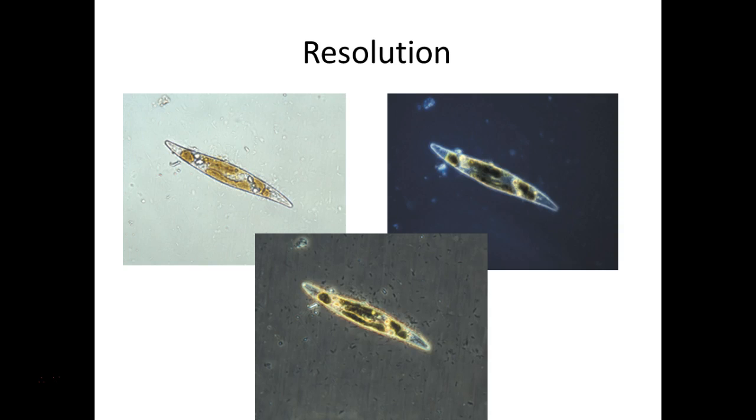So contrast, right? If we stain them, we kill them. And if you were looking at somebody like this Euglena, who usually swims around, if you stain them, what is he not doing anymore? He's not swimming around, right? So if you wanted to see something like motility, you can't stain them, right? Because you're going to kill them. And unless we're talking about zombie bacteria, which I haven't seen just yet, or zombie protozoa, or protists in this case, yeah, they're not going to move when they're dead.